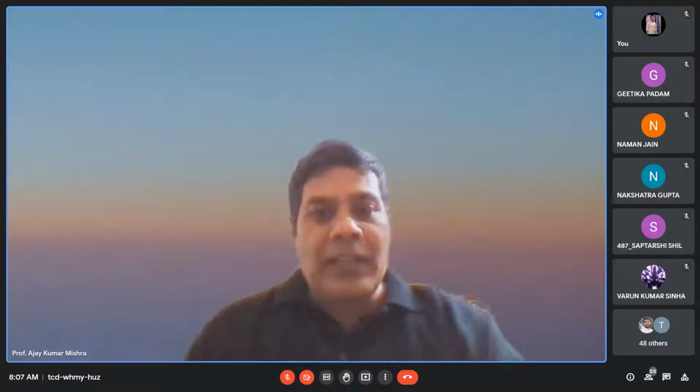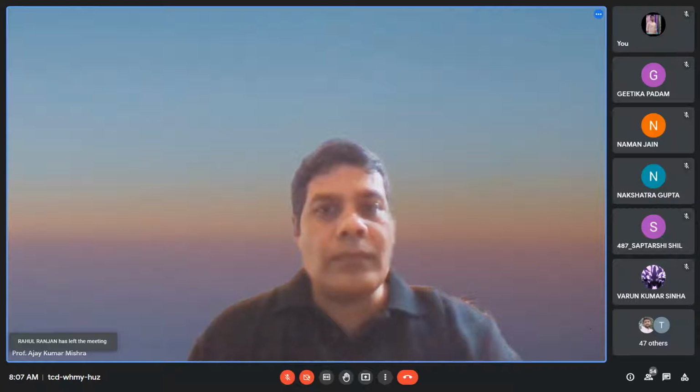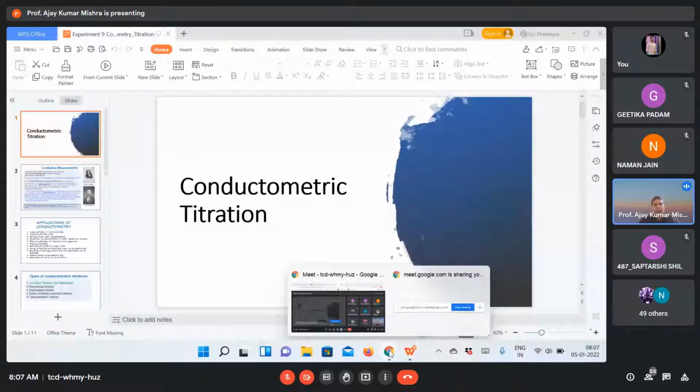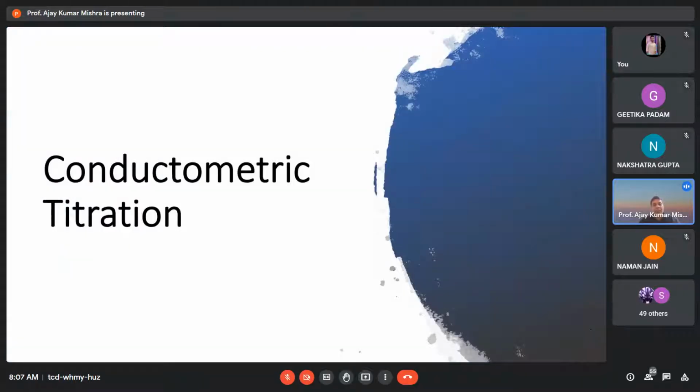Let me just try to share the slide. Okay, can you see? Yes, sir. Right. So as you know, today we are going to do this so-called conductometric titration.